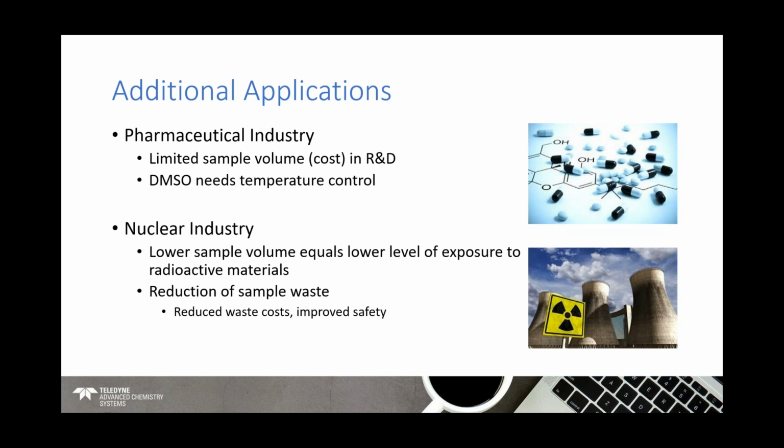DMSO is another one of these solvents which is typically used in the pharmaceutical industry. And unfortunately, DMSO has, I mentioned before, a solidification point just shy of room temperature. It's about 20 degrees C, I believe. So you've got a scenario where if you have a colder day in the lab, you might end up with a problem in terms of sample introduction or in your nebulizer, for example.